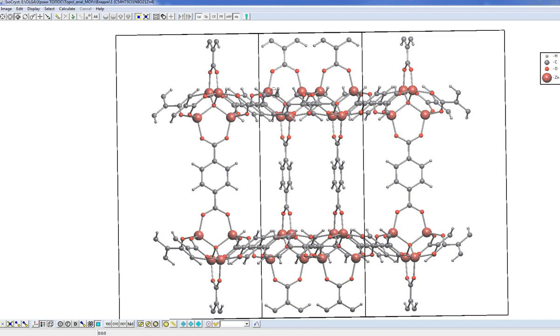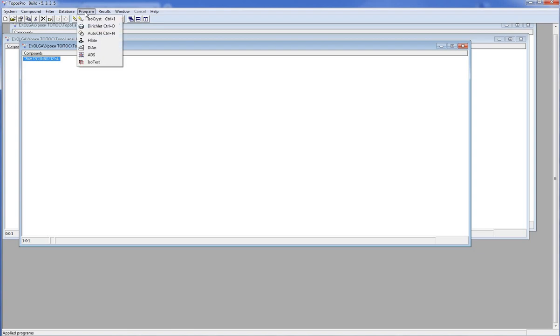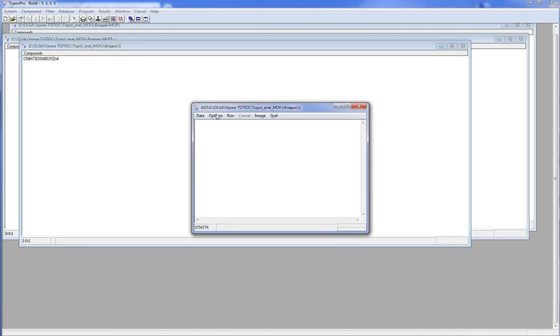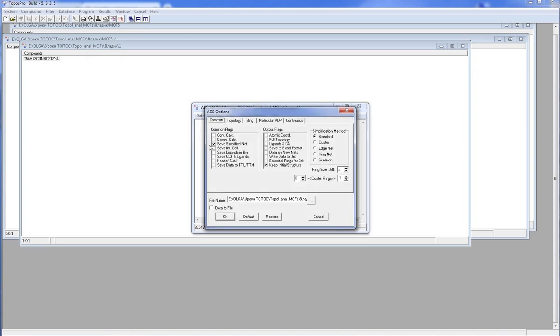We should choose metal atoms and organic ligands as structural units and replace them with their centers of mass. This is the so-called standard representation in Topos Pro. So to construct the underlying net we run ADS, options, and here we should select the save simplified net option, standard method. I also check the option keep initial structure to merge the initial and simplified structures together.